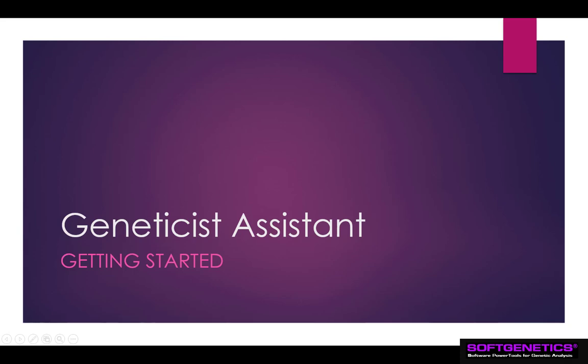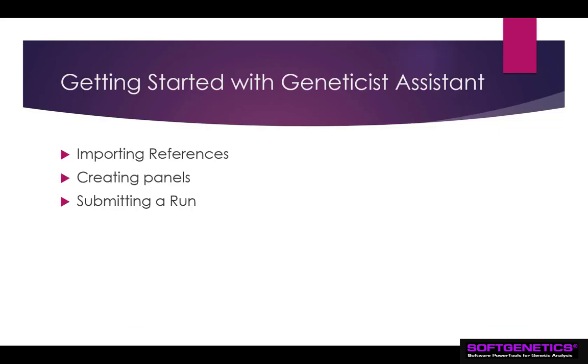Thank you for viewing this webinar, which will discuss getting started with Geneticist Assistant. In this webinar, we'll cover importing external references, creating panels, and submitting a run.